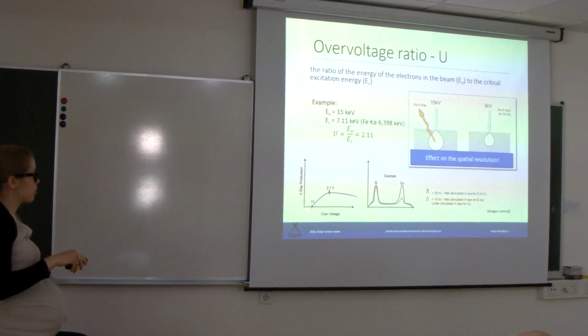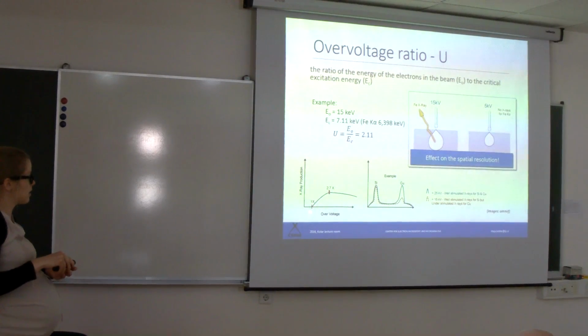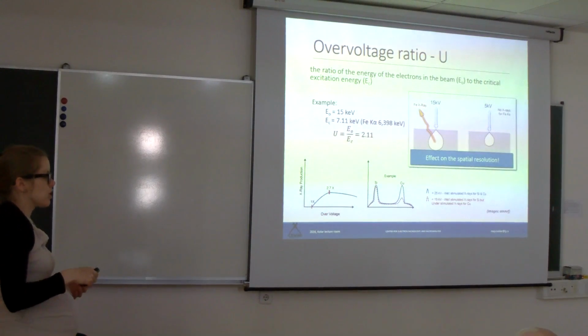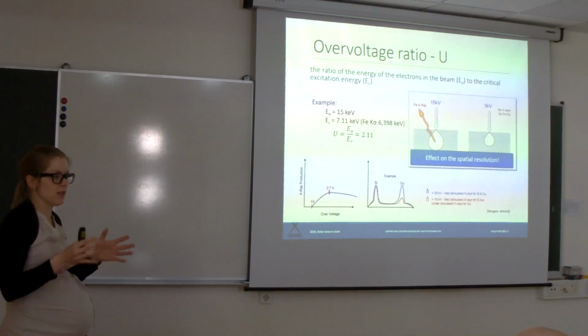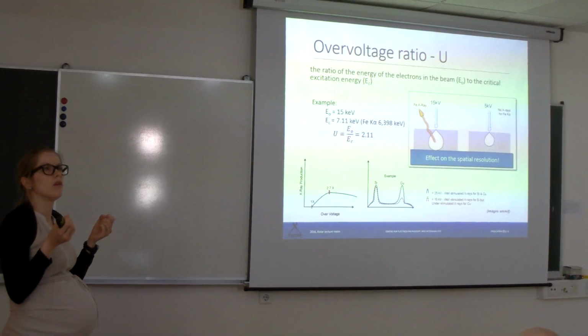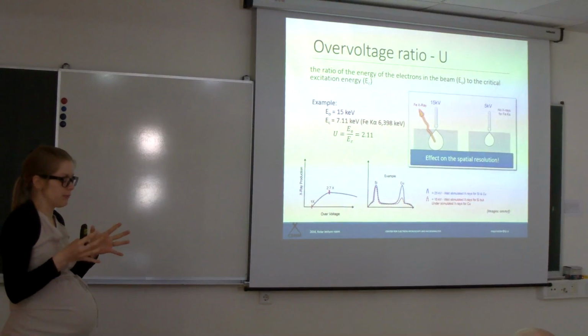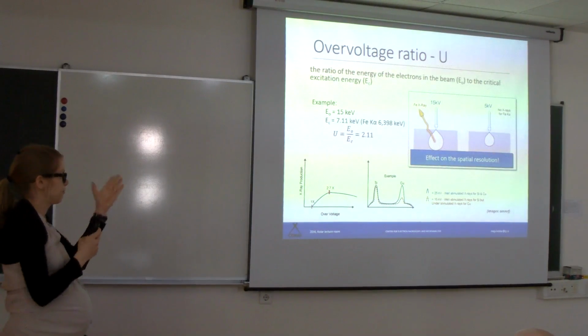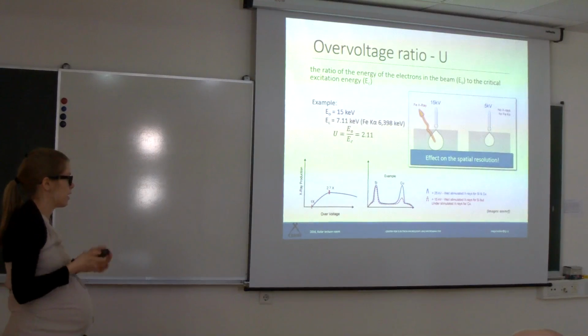So the X-ray production goes something like this, and then it drops a bit. So the optimum is 2.7. Okay, this is determined just by the physics of the ionization of the atoms. So it's a formula, nothing special.